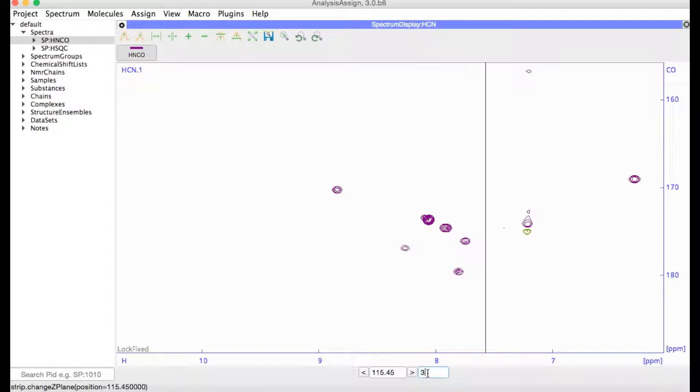Now at the moment, I'm looking at the spectrum with carbon along y and nitrogen along z. If I'd like to look at the planes the other way around, I can just swap the y and z-axis with yz.